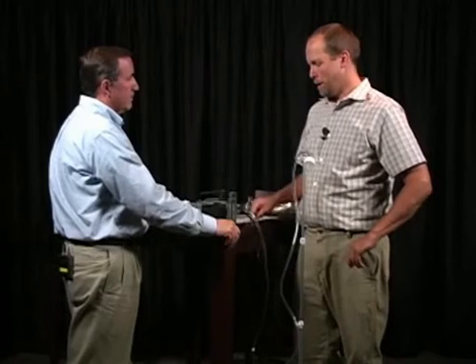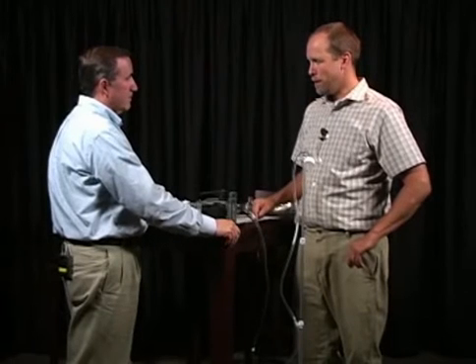So the inspector has to pay attention to the placement of the sampling equipment, front yard, backyard situations, and wind direction, making sure that the sampling device is right into the wind, and also weather conditions and temperature. Temperature is important only in the extreme, when it's very, very cold. And as I say, keep it in your front pocket or in a heated part of the building or in the car before you take it, and you should be okay.